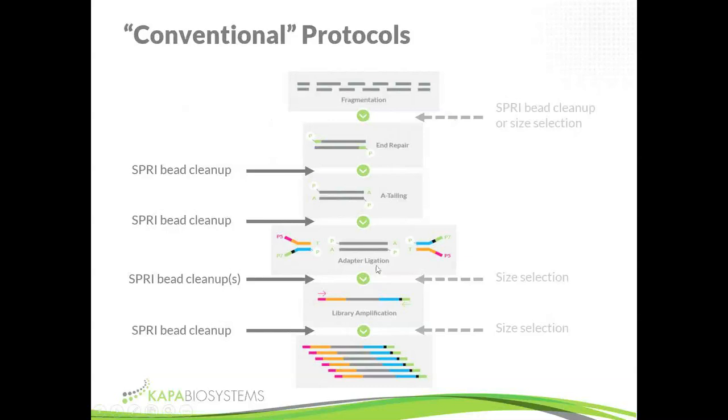And then after ligation or after amplification, these are two places where we can also do size selection. We've talked a lot about library fragment size, the need to match your fragment size to your sequencing chemistry, your sequencer, your sequencing application, and your sample type. For some applications, a very narrow size distribution is preferable, especially for de novo sequencing. Fragmentation will give you a size distribution of molecules. It's not a single peak of sizes. So after ligation, you have a size distribution, and in some applications there's very good reason to narrow it and remove bigger and smaller molecules through a process of size selection.